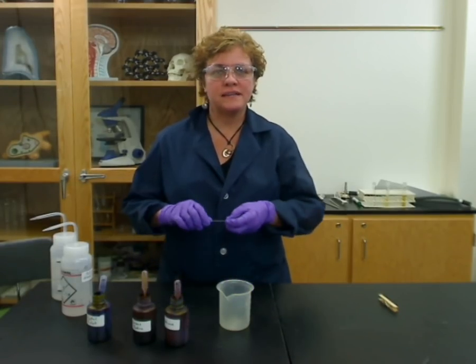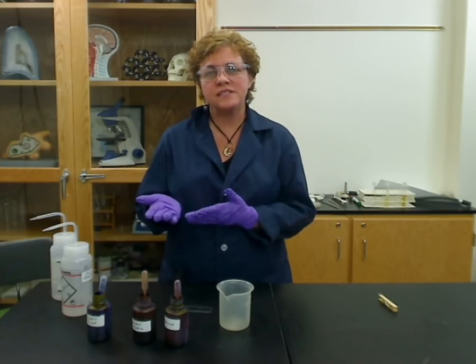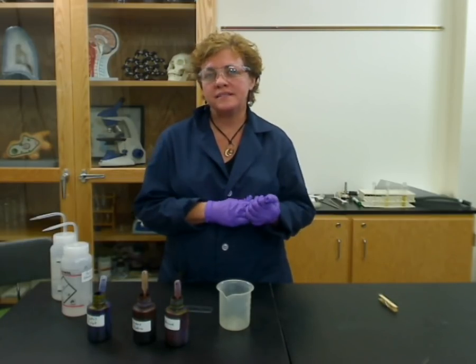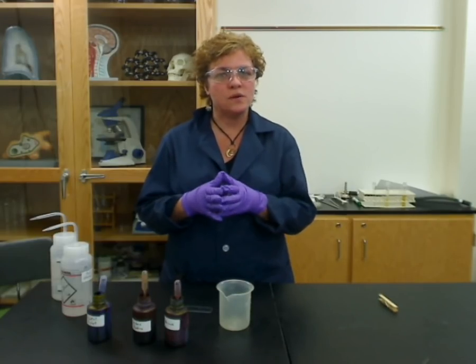Today I'm going to be showing you how to make a gram stain. Gram stains are good for distinguishing between different types of bacteria. There are gram positive types and gram negative types, and it's based on the structure of their cell wall.